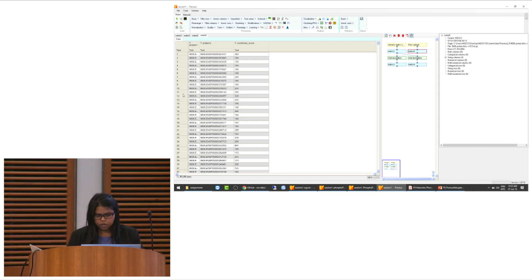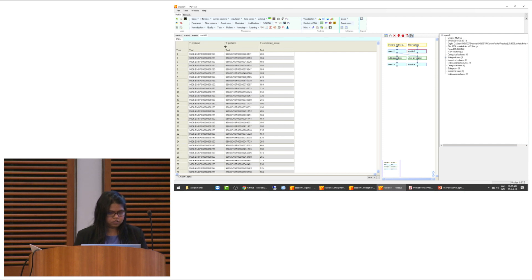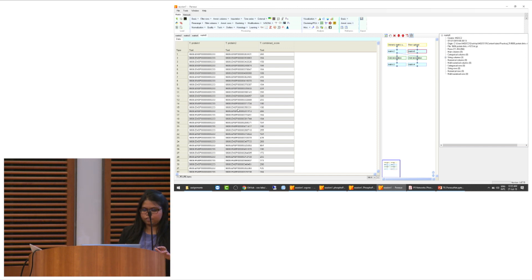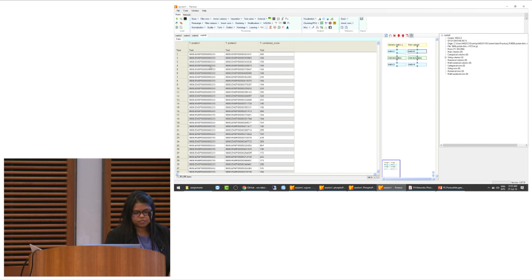While this is loading, you can see it contains 11 million entries or so. What you can see here is Protein 1 and Protein 2 — this is just a very large dataset so please wait for it to load.